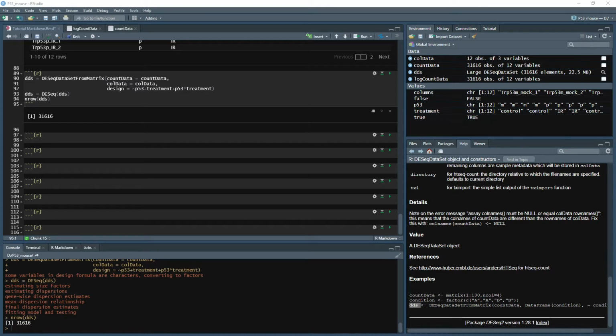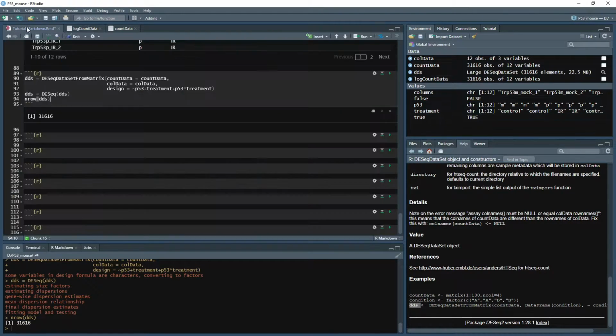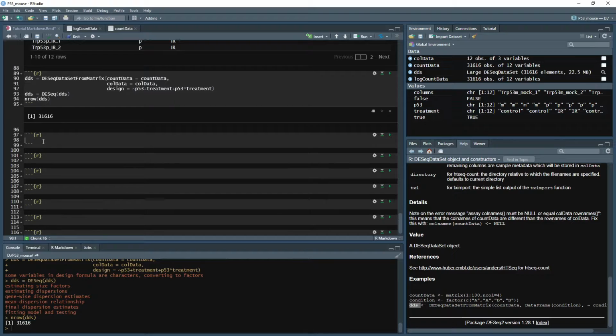Additionally, there are ways to filter. If you don't want to look at all of the zeros, we can set a threshold there. Generally, if there are zeros somewhere, it's not always the case. Like in here, we have 1. But we can filter this out a little bit if we want to, say, less than 3.